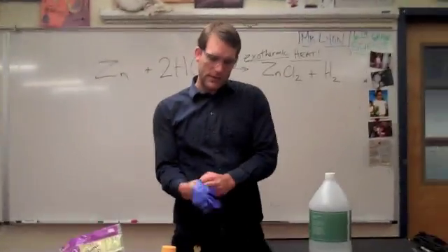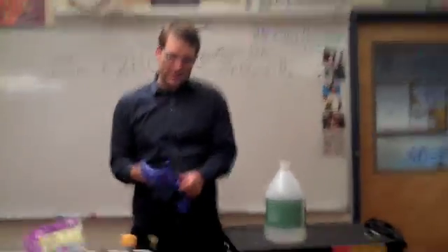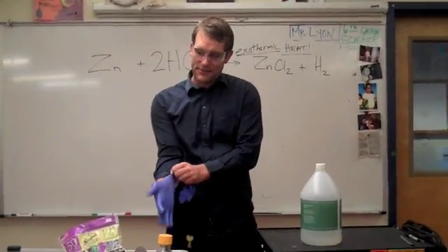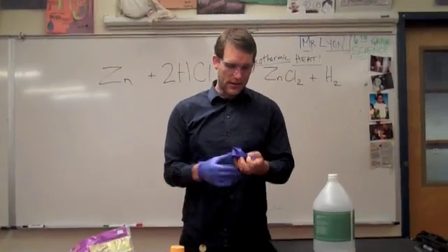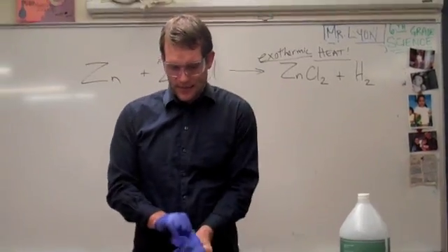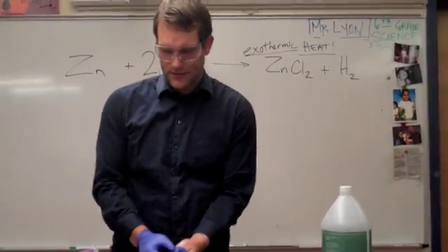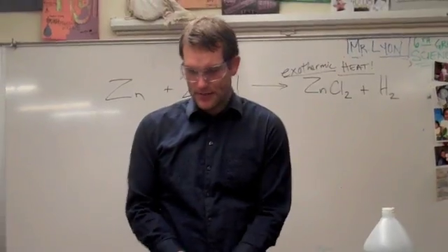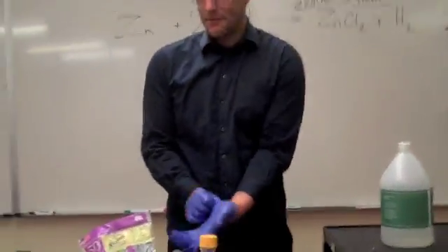When we generate hydrogen gas and use strong acids, we always have to wear our gloves, and of course I've got my goggles on. What I'm going to do is simply take a flask and put some zinc powder in it. Zinc is a metal.